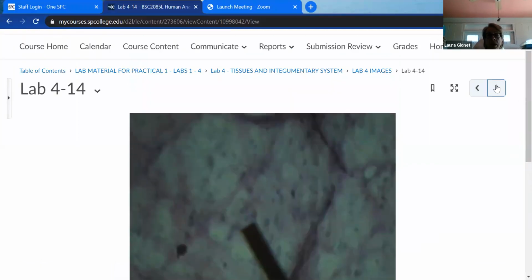And this could be focused a little bit better, but it's hard when you're using your phone to take a picture like this. This is areolar connective tissue. Where do we find that? Subcutaneous or hypodermis. Function: helps attach the skin to the muscle. That's fine. This is the one that I said is the Jackson Pollock painting of tissues. It has this random organization to it.